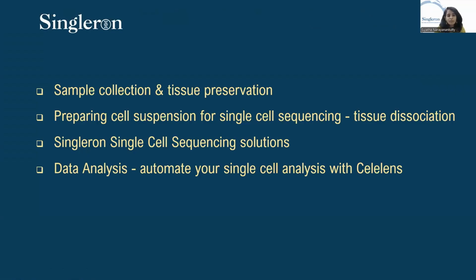For today's talk, we'll go through these 4 steps, starting with how to collect and preserve your sample. How do you prepare a good single cell suspension? What are the sequencing workflows you can use? And then finally, what does data analysis for single cell look like?